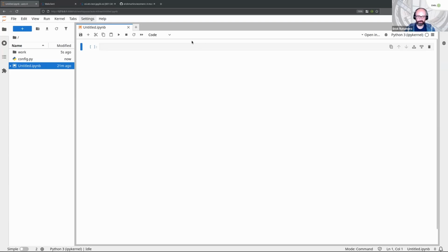In addition to the two things I'm going to be showing in this introduction here, OMERO has a command line interface too that can do a lot of stuff, almost everything you can do. Because it's similar in terms of functionality to the things we're going to be doing, I didn't want to show an extra thing. So we're going to stick to Python, but you can do most of these things on the command line as well.